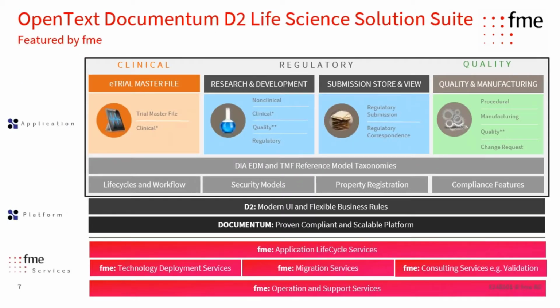This is a slide that we touched on throughout the webinar series. Today, this has all the solutions, or modules, if you will. We touched on some of them already, and today we're going to focus on the research and development module. As you'll see underneath, in the application stack on the top, you have a variety of industry best practice services that are part of the solution.